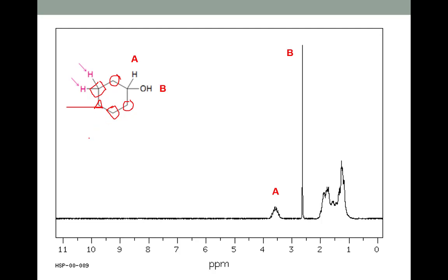Now, in practicality, as we just talked about, since we have a stereocenter on the alcohol carbon, or we will have had a stereocenter on the alcohol carbon if we did a substitution over here, we could end up with potentially 2 different signals from these guys, very slightly different. Imagine one of these hydrogens is above the ring in the same place as the oxygen.